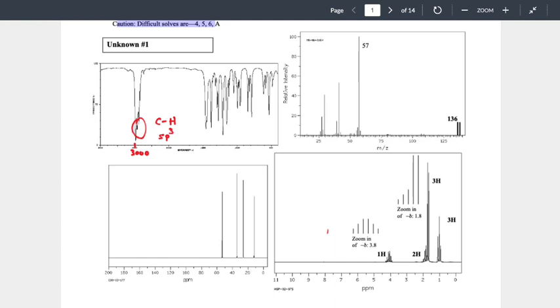I was taught that way. I don't have an answer. But you looked at this one. What is different from that one versus those? They are past 1600. Okay. There's a range that we start to look at. When we look at IR, that's interesting that you said 1600.